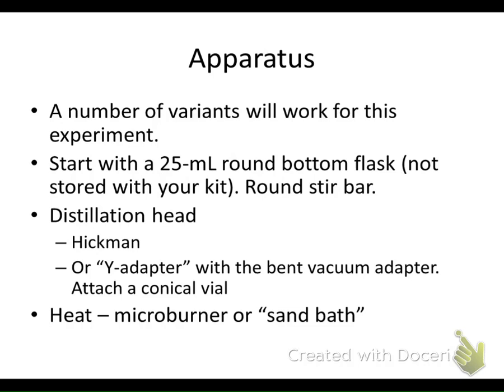A stir bar is the only item we have in our kit, really, that is capable of providing a fairly good mass to create a good boiling stone at the bottom. So again, use a stir bar, stick it in the bottom, stir it, to try to break up any of the unusual boiling that might happen.